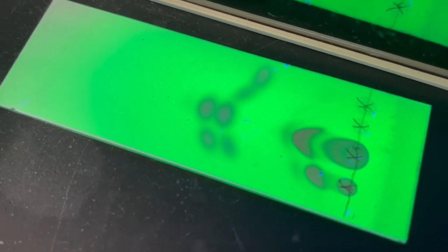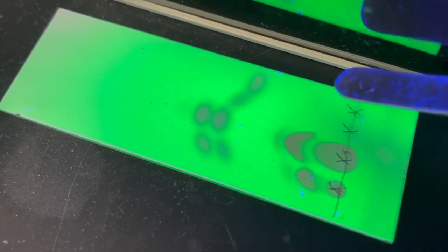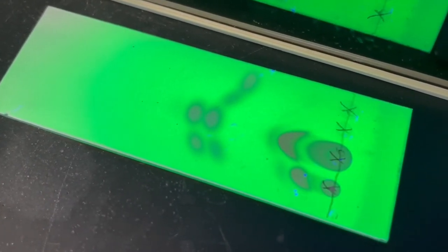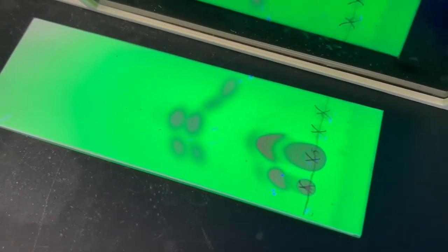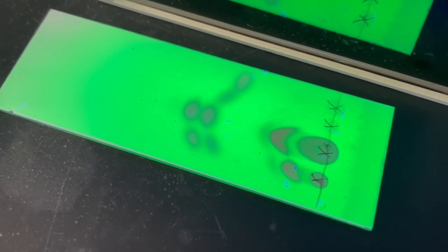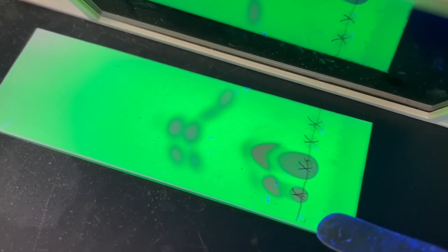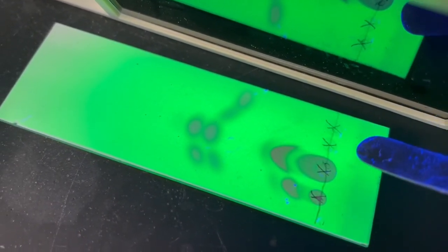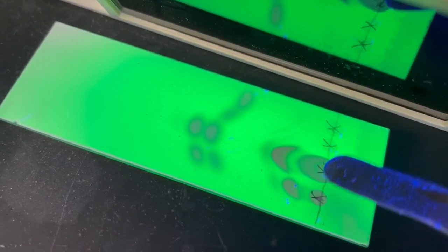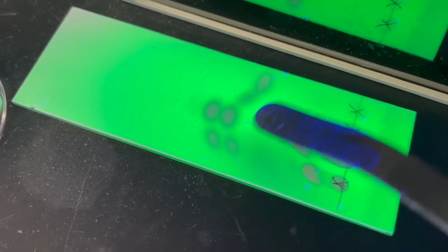Again, when I placed it in there, for whatever reason, the solvent started coming up at a little angle like that, and it continued, because once it got wet, it went at the same rate consistently. So everything traveled at that pace, and it all pretty much traveled the same distance, but it started at different times. The solvent got on here, and then it immediately curved, so that means these middle ones started running up the TLC plate sooner, and that's why it's curved. But in any case, we're going with these ones right here, and then that one right there.